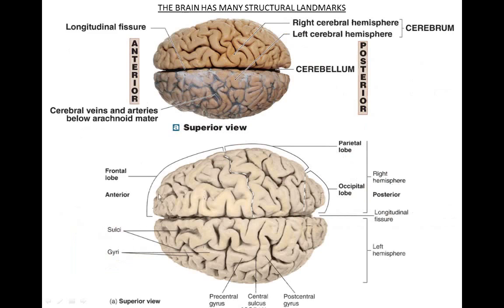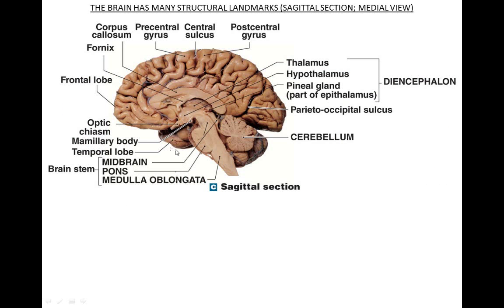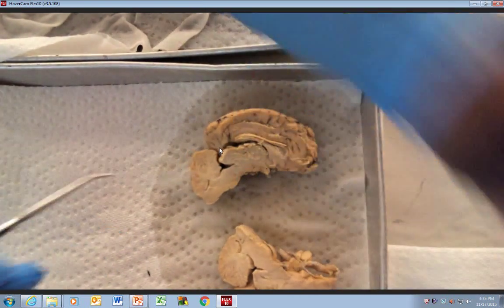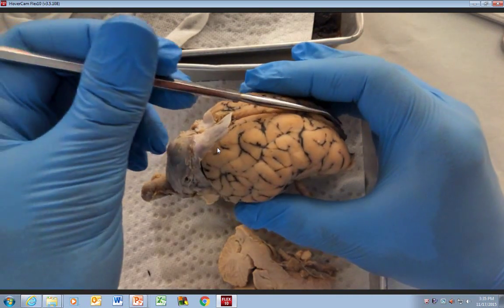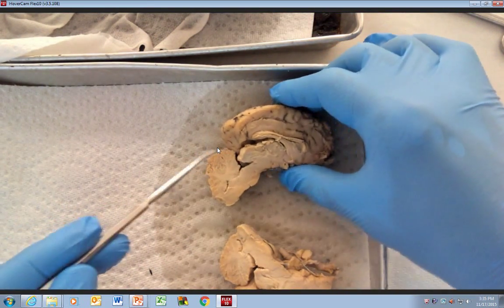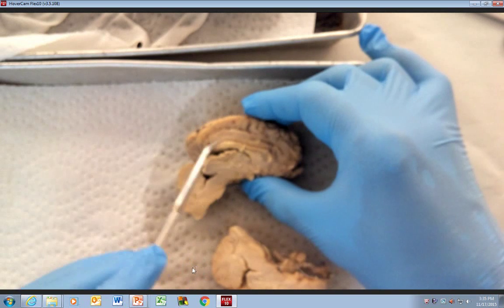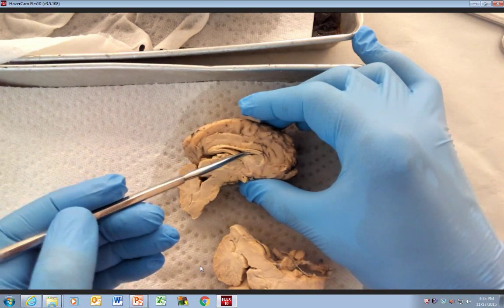Okay, so what we just looked at was the superior view. Now we're going to look at a cross section. We took a brain like this and did what's called a mid-sagittal cut, and now we see a medial view. You can see the cerebellum right here, and the thalamus right here. On top of the thalamus here's the corpus callosum. And if you open up, these are the lateral ventricles.